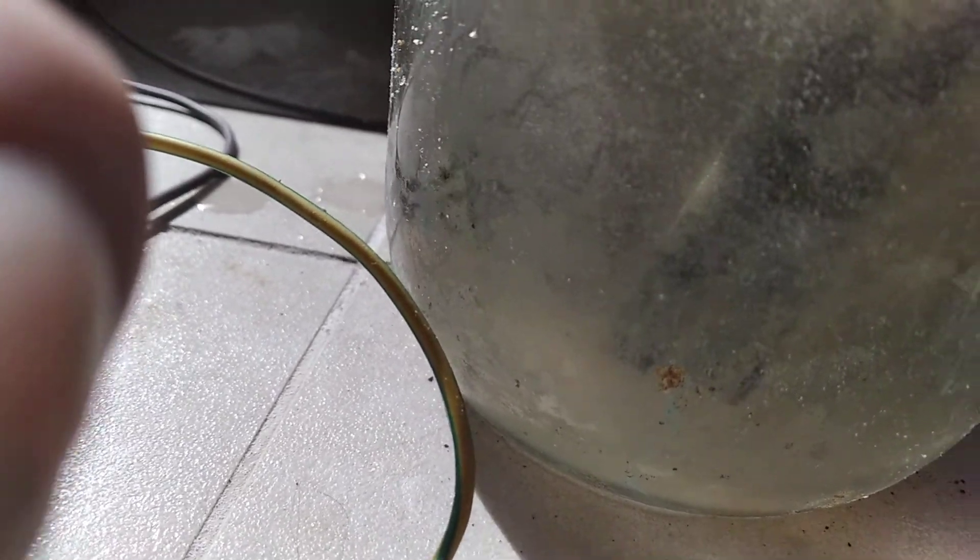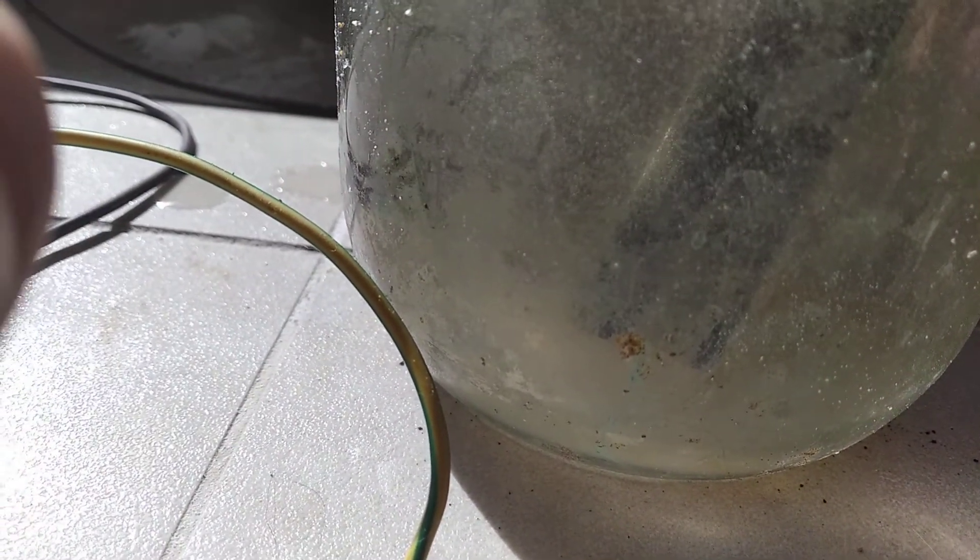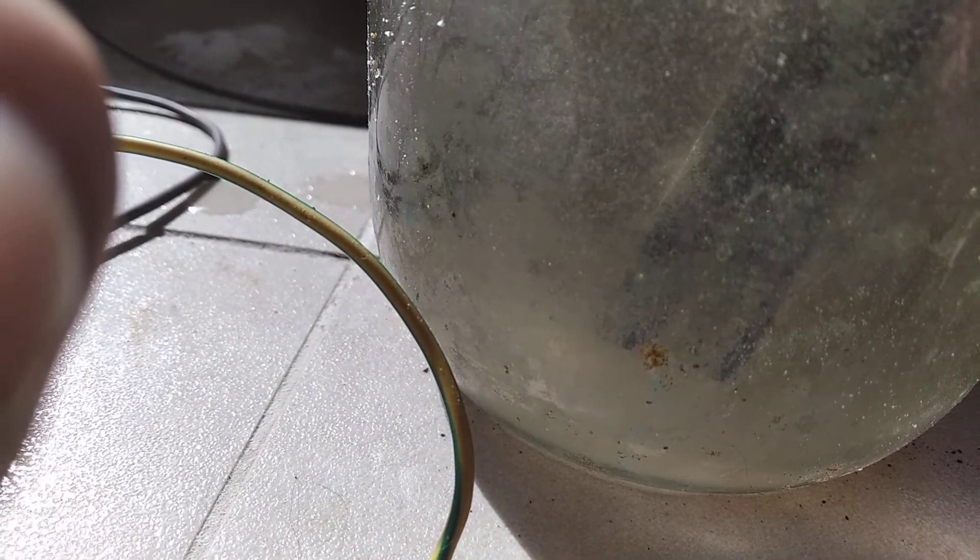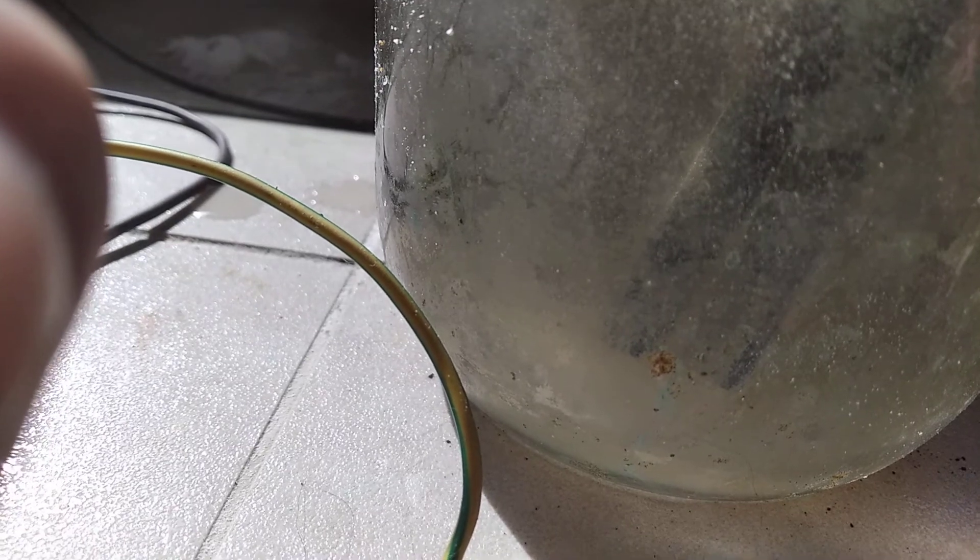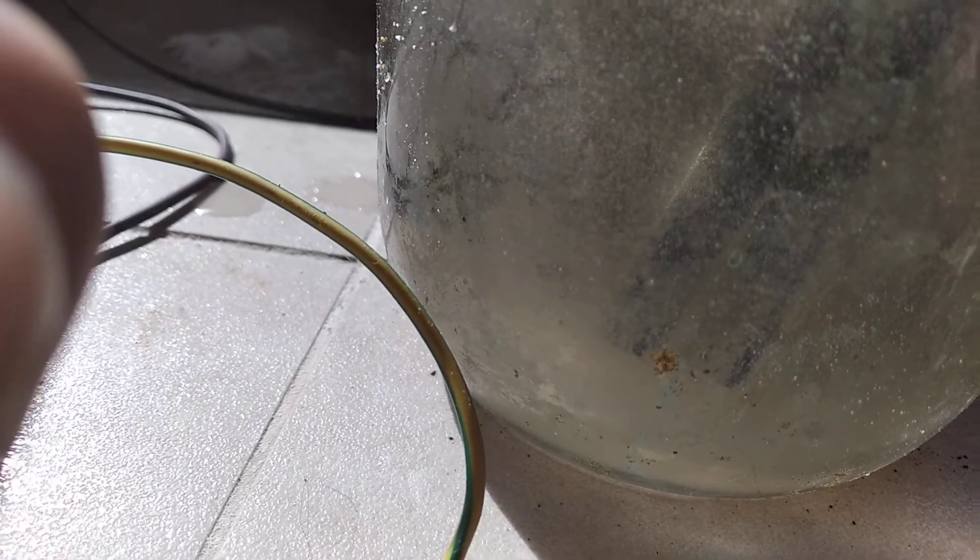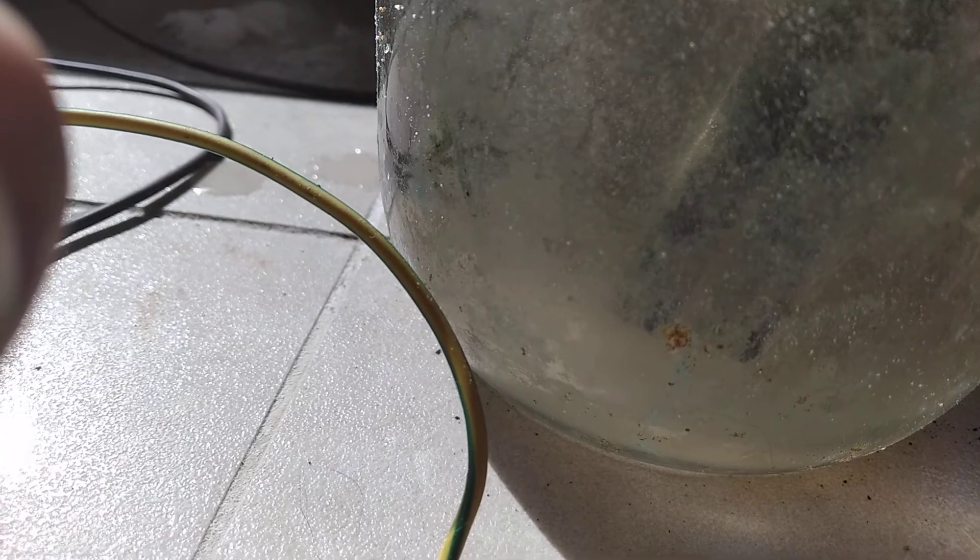So that's all for now. I just made an explanation to see if graphite can withstand the pH controlled cell without erosion and the test has been successful. However I will have continuous updates of this experiment for the coming days, so you'll see some updates later. Okay bye!